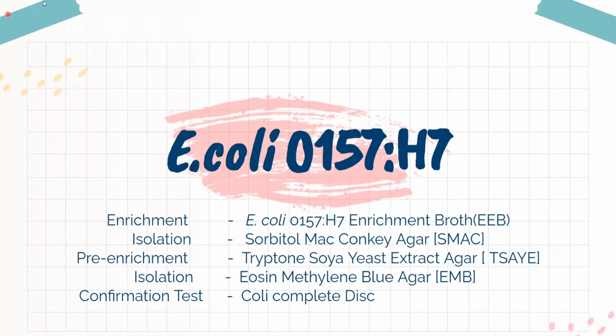So the topic for today's video is the isolation and detection of the foodborne pathogen E. coli O157:H7. As we all know, it is a very fatal foodborne pathogen that causes traveler's diarrhea, or this particular strain is also called the EHEC, that is enterohemorrhagic E. coli. So how to detect these?